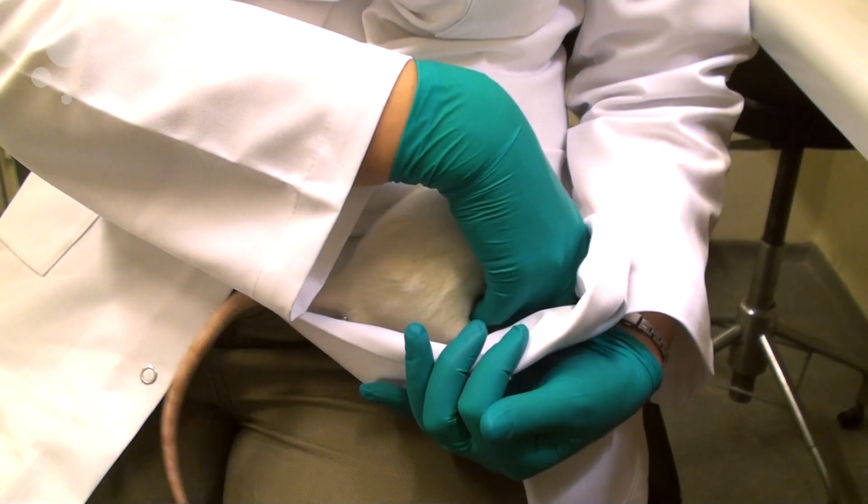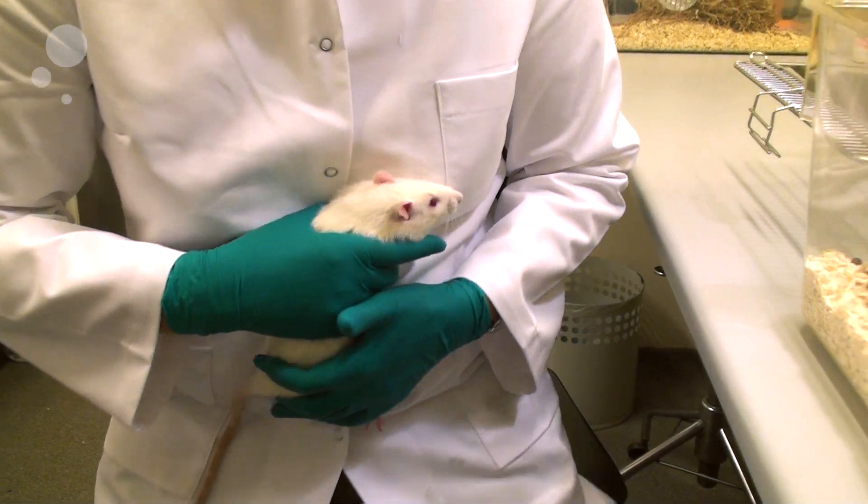When you're done with the injection, you just pick him up as you would a pet rat and put him back in the cage.